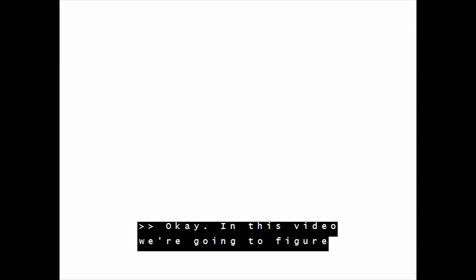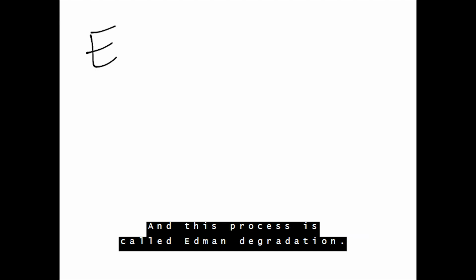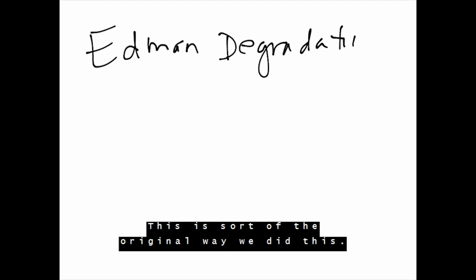Okay, in this video, we're going to figure out, once you know the amino acid composition and maybe the first amino acid, how do you actually sequence the rest of the protein? And this process is called Edman degradation. This is sort of the original way we did this.